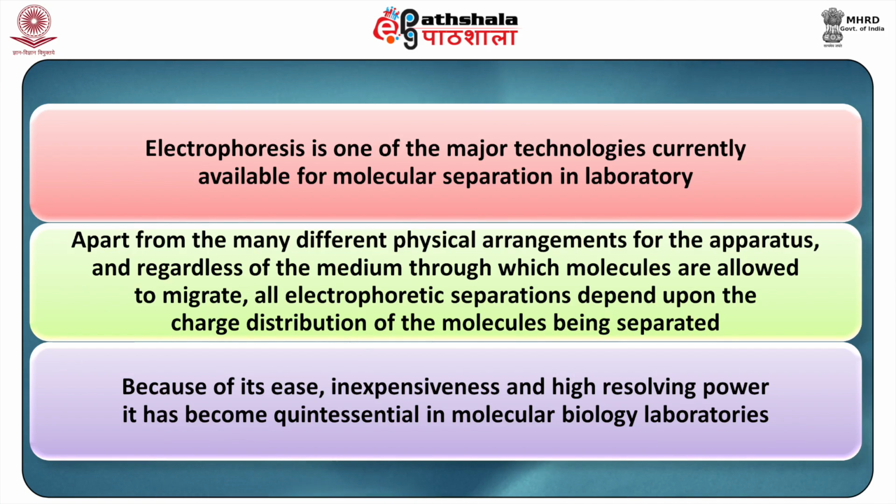Electrophoresis is one of the major technologies currently available for molecular separation in the laboratory. Apart from many different physical arrangements for the apparatus, and regardless of the medium through which molecules are allowed to migrate, all electrophoretic separations depend upon the charge distribution of the molecules being separated. Because of its ease, inexpensiveness and high resolving power, it has become quintessential in molecular biology laboratories.